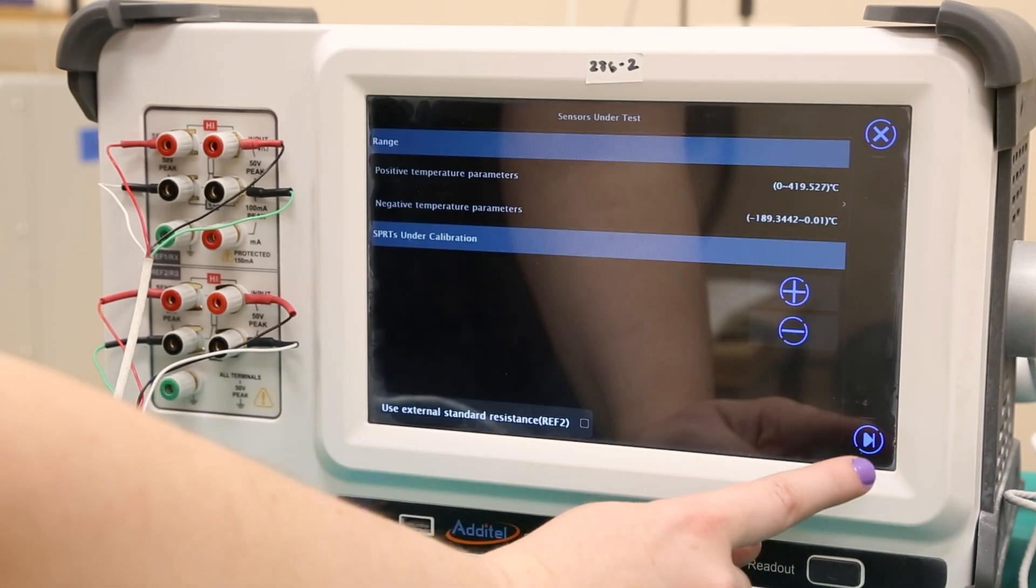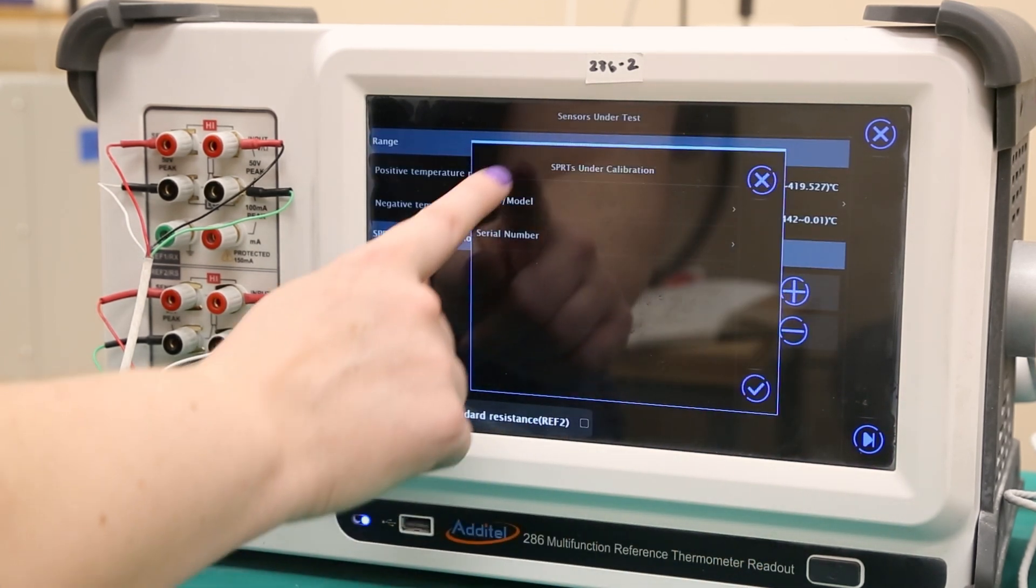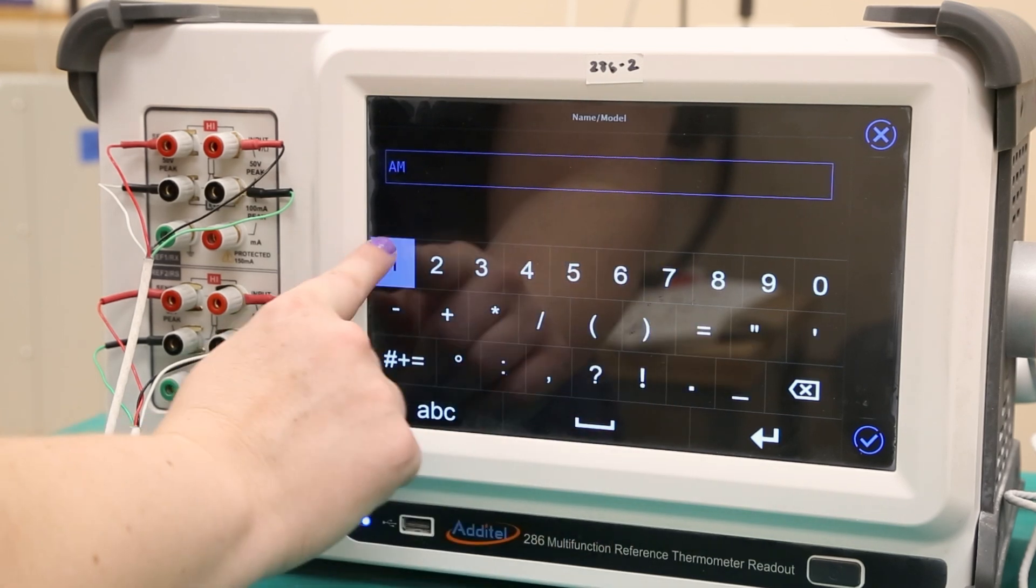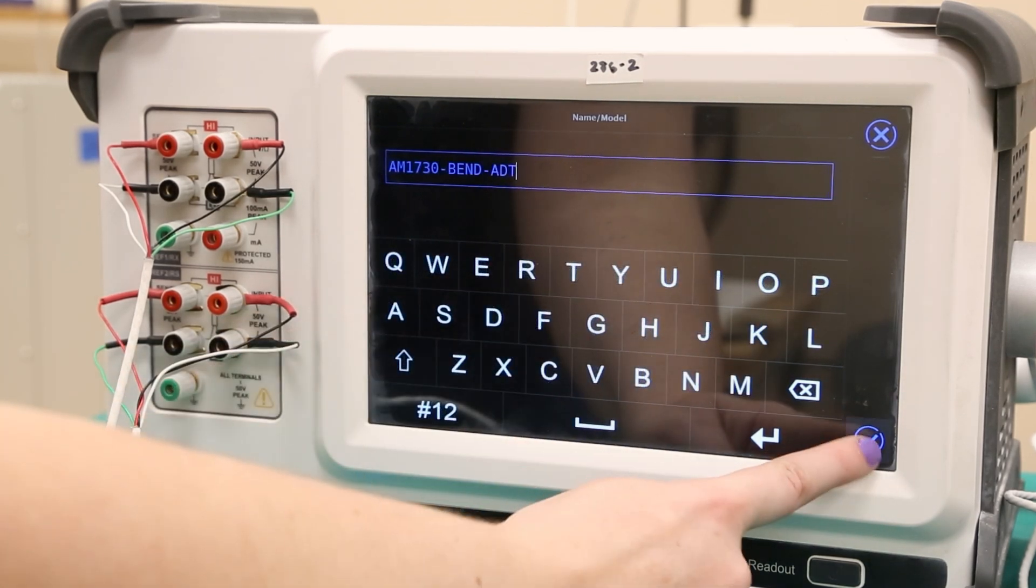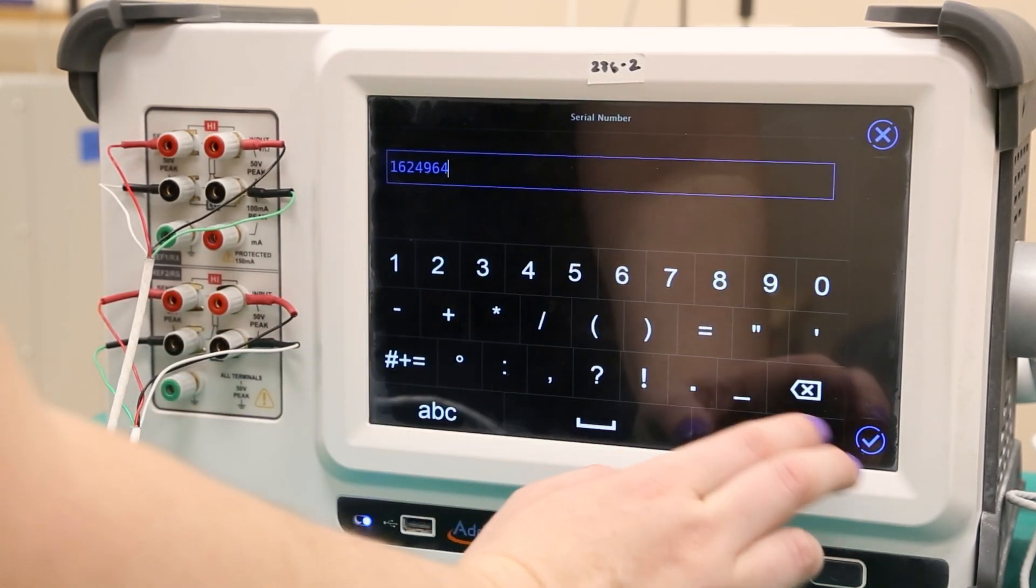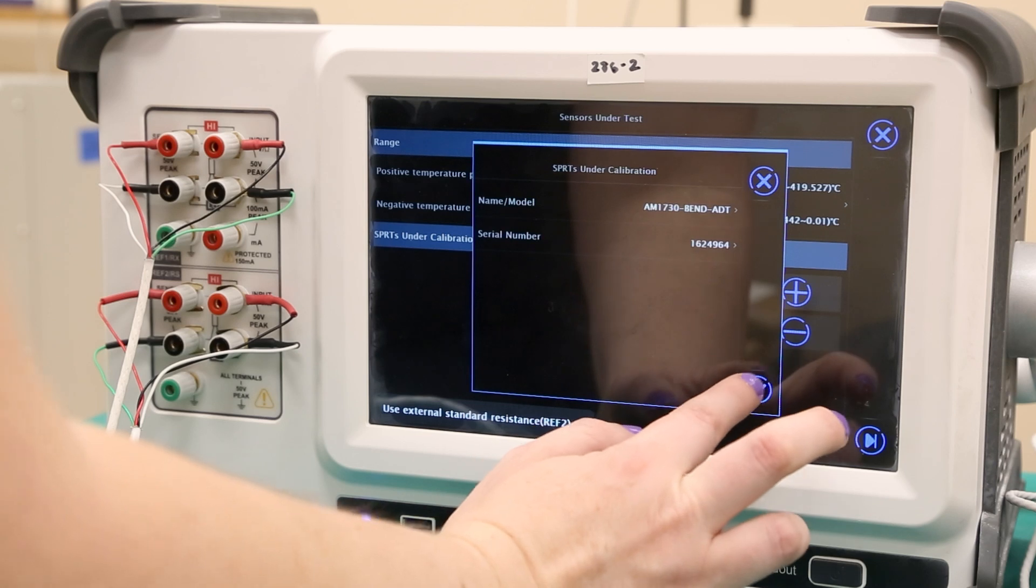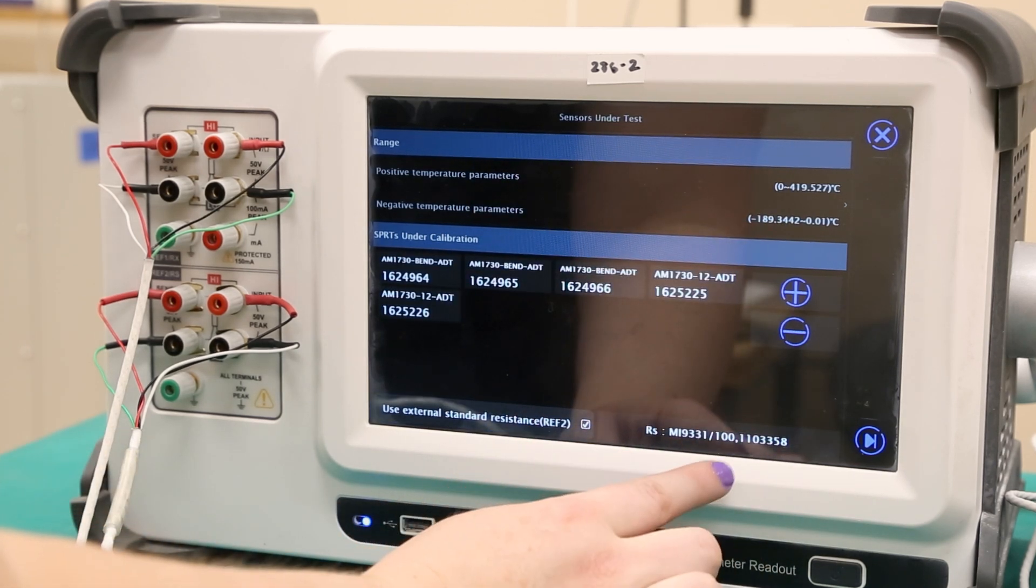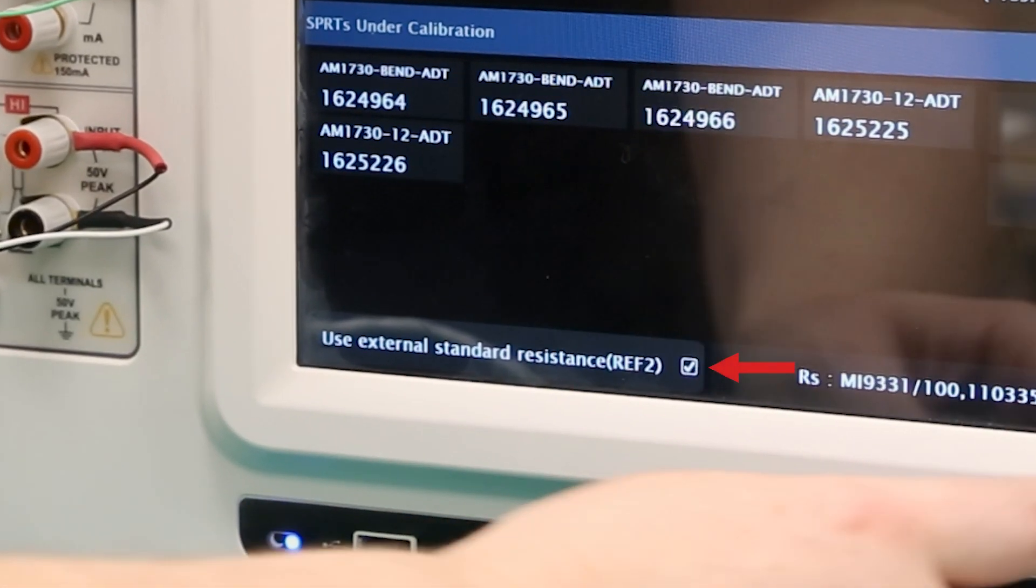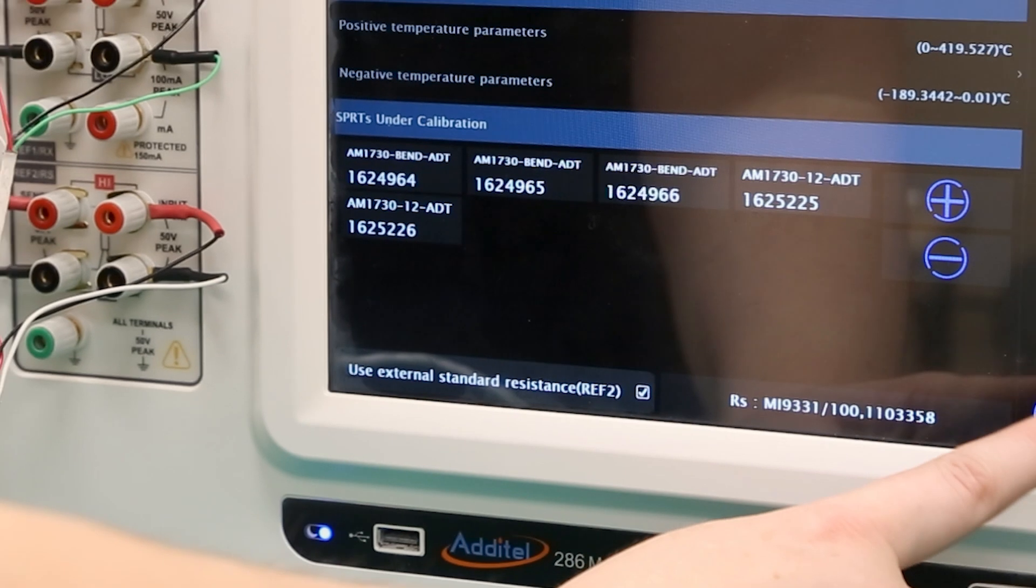Next, we will add the five SPRTs that we will be calibrating by pressing the plus button. The name and serial number on these probes should be recorded to ensure accurate traceability. Once all probes have been entered, we will check the use external standard resistance option before pressing next.